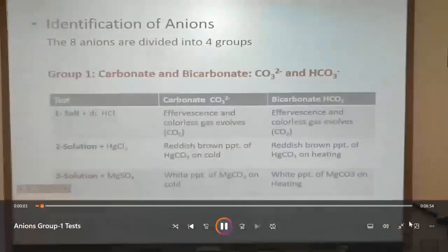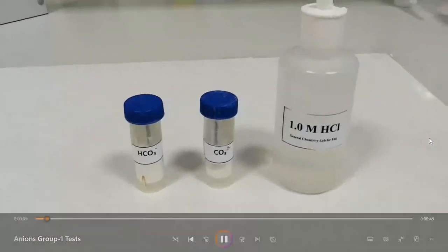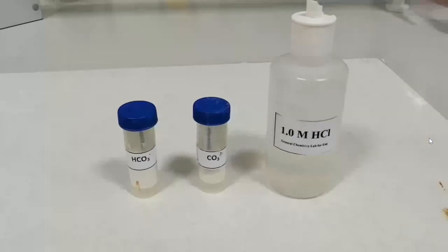First, we are going to discuss the first group, which is the dilute HCl group, and we will discuss four anions: carbonate and bicarbonate, nitrite, and thiosulphate. Now I'm going to share the first video. Okay, here it is. We start with carbonate and bicarbonate.